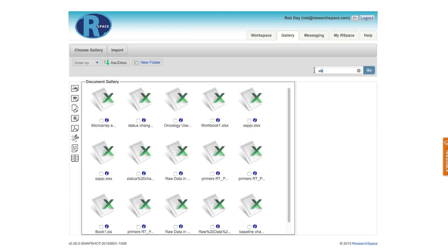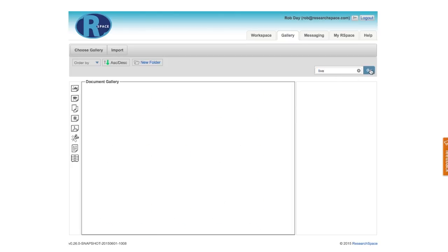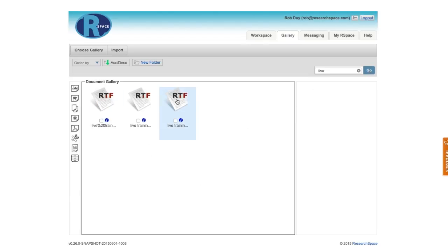I could also choose to filter based on some string of characters in the file name. So for example, if I only want to see files that contain the RTF string, I can put that into the filter, and that reveals these three files here.